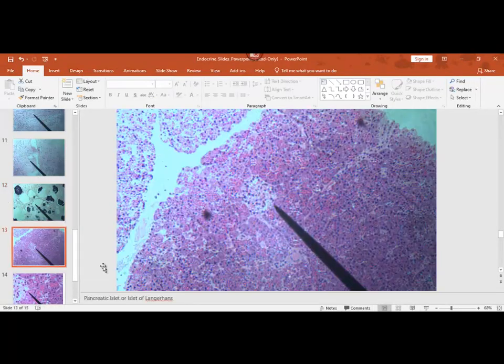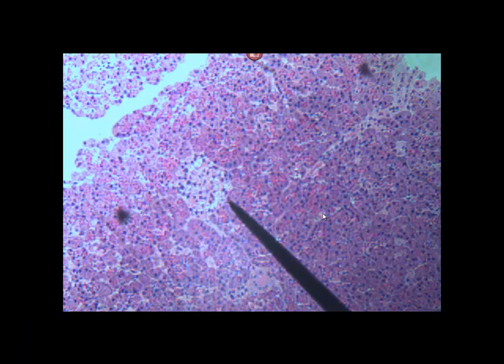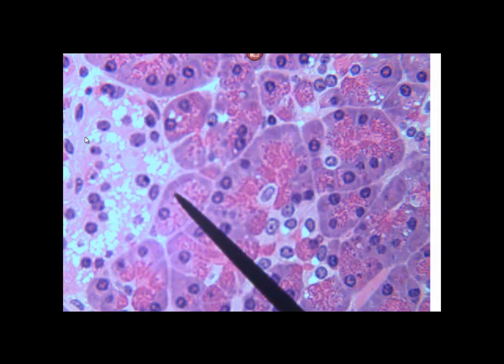But you can tell, and here it is. Here is a pancreas. All this stuff around it we will cover when we get to digestion, but see this little white area here? It's called an islet of Langerhans, or a pancreatic islet. So it goes all the way around. Now the next picture is super close, which I wouldn't use, but see it in the corner over here, and you can see the margins right there. That is an islet of Langerhans.